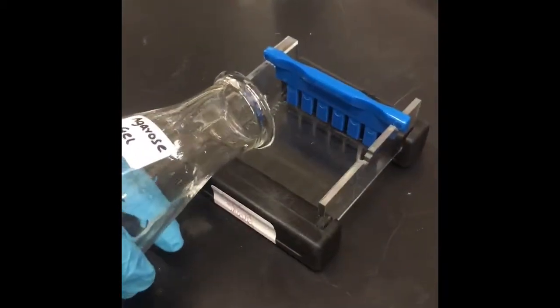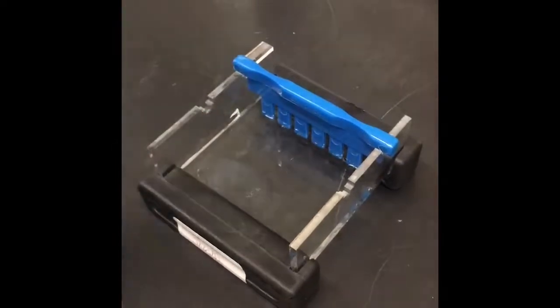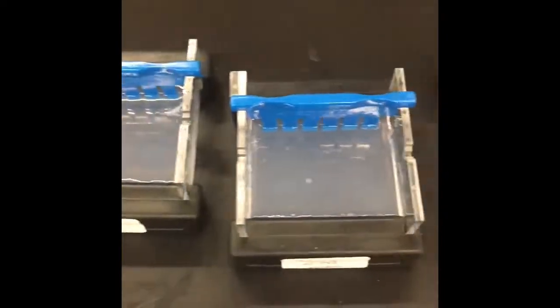Then we put it into our casting unit and we start pouring the agarose from one side, making sure no air bubbles are seen in the casting unit. We let the agarose set and form a gel. As you see, the gels are formed over here.